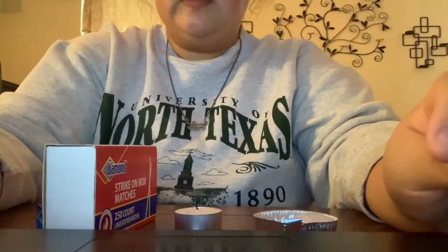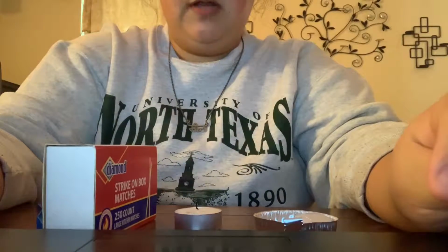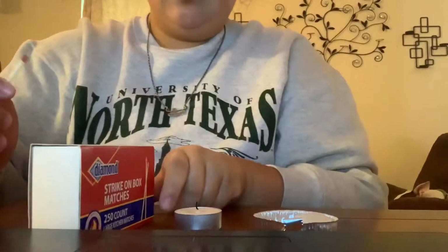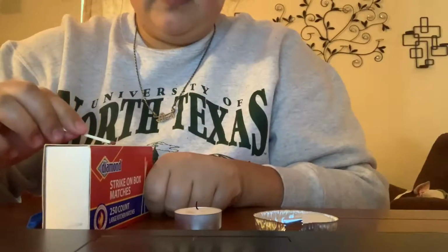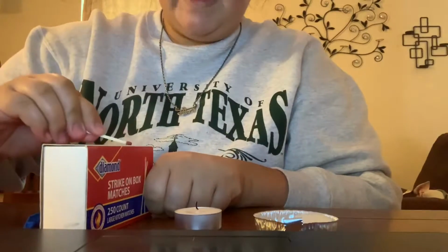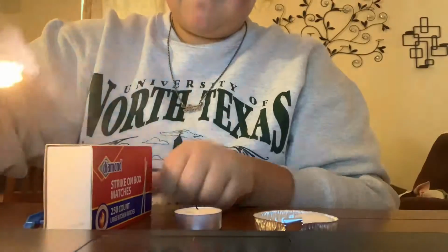After reading the instructions for activity 4 and recording all of the current data with the candle, I will simply light it on fire and then record any further observations. I hate this.